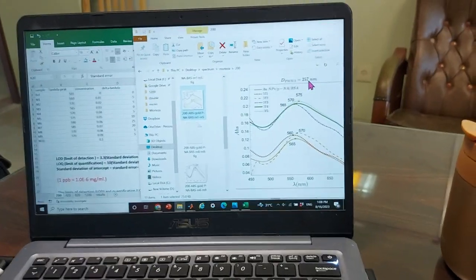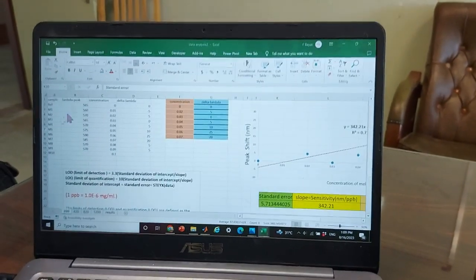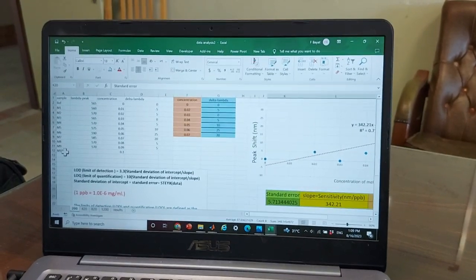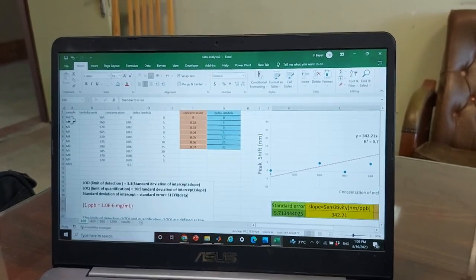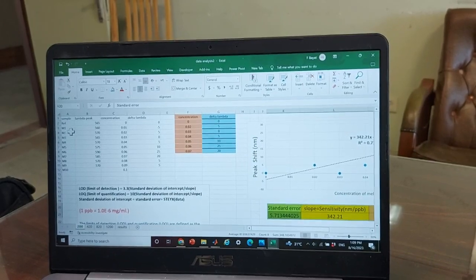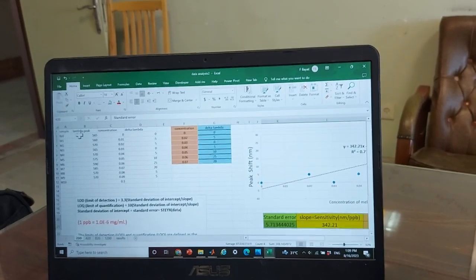Diameter of 257 for Mortaza's first sample. I made the Excel file. Here you see the name of the samples. I just made the names similar to the concentration that we have applied. The reference one is without any melamine, then M1, M2, M3 till M10 with melamine, after melamine injection.